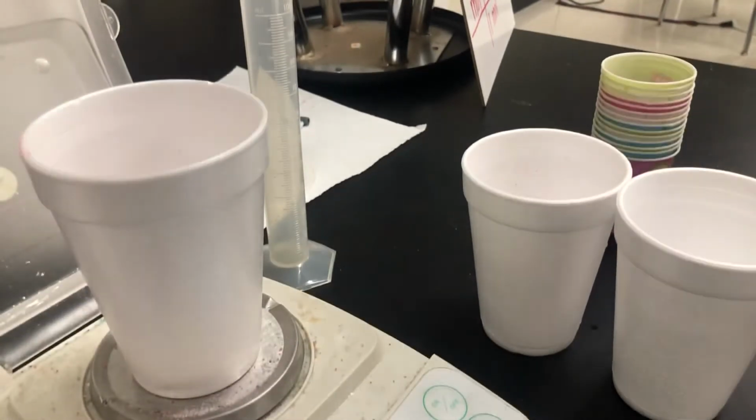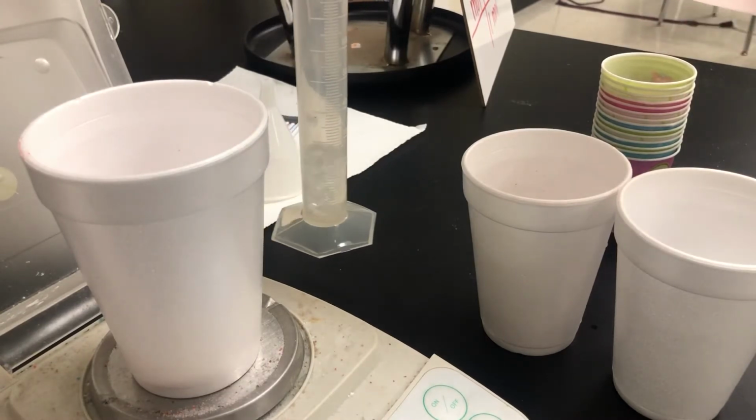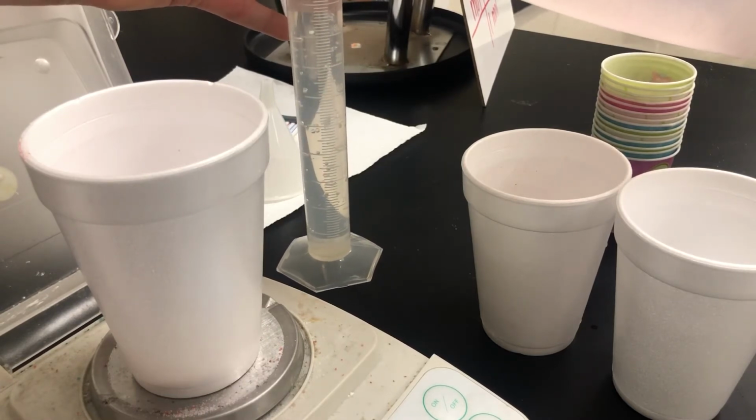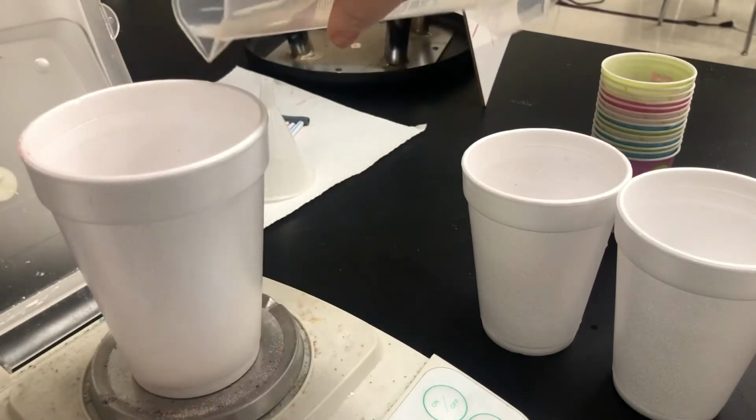Then I'm going to take my water jug. I'm going to fill up my graduated cylinder with 100 milliliters of water. And I'm going to pour it into the cup.